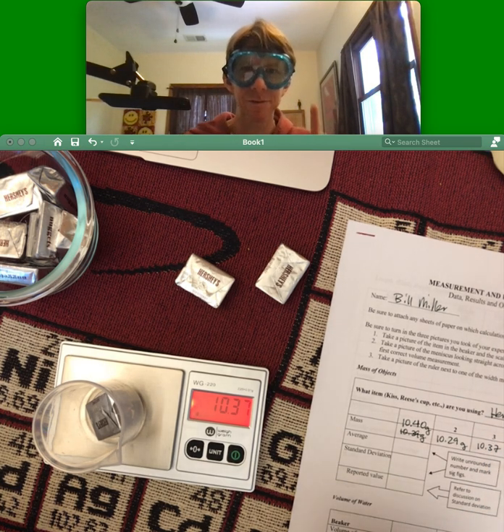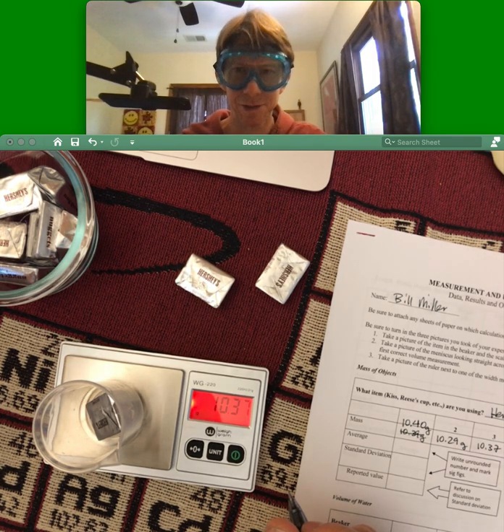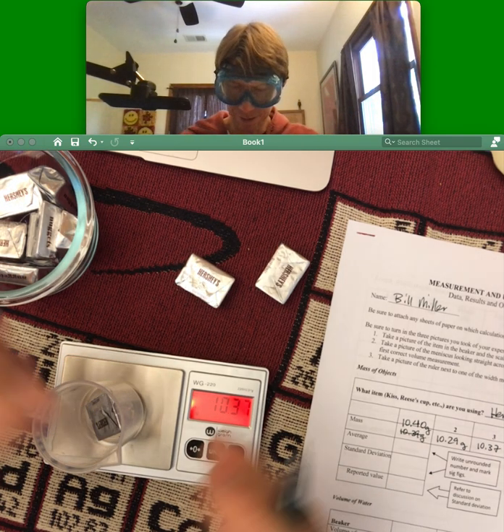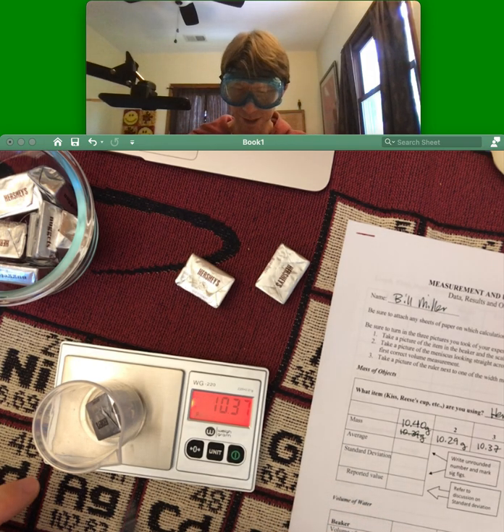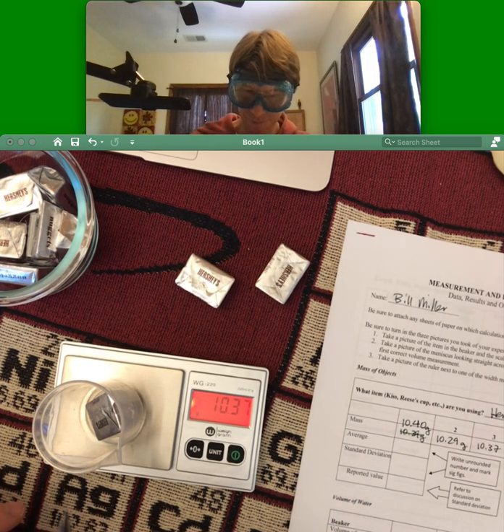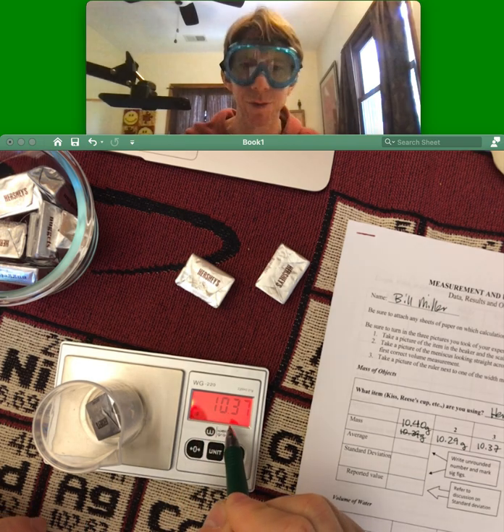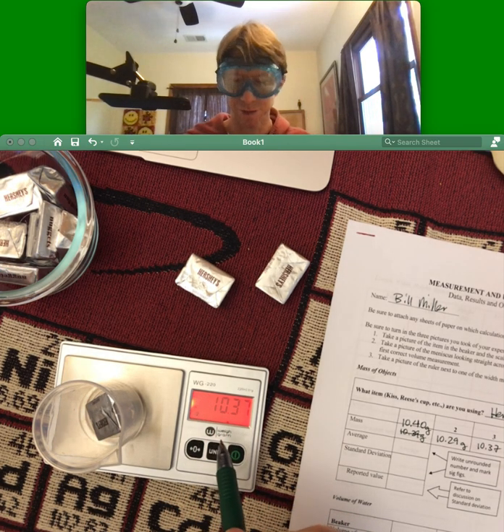Oh, I forgot to mention, after your first one, take a picture. My camera's actually recording right now where I would take a picture. But take a picture so I can see whatever's on your scale and the scale itself and the measurements, for at least the first one.